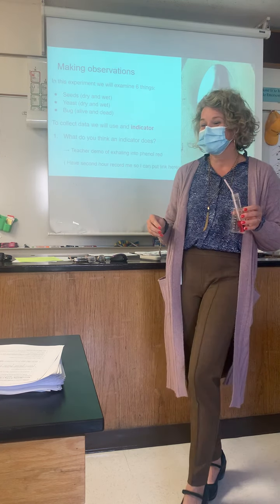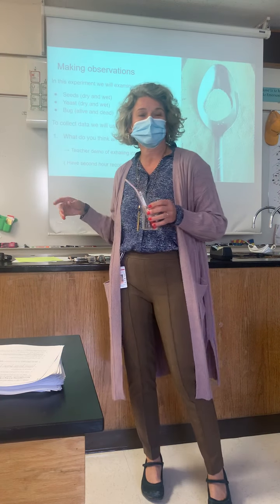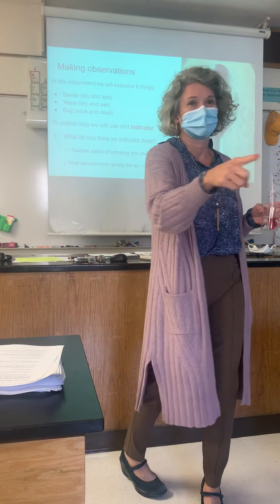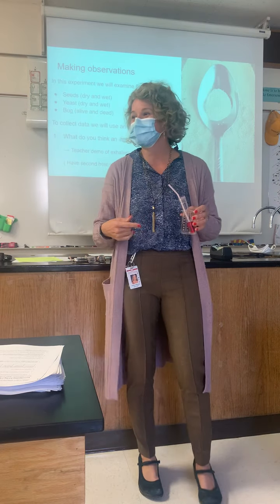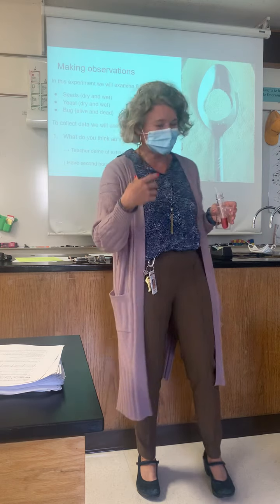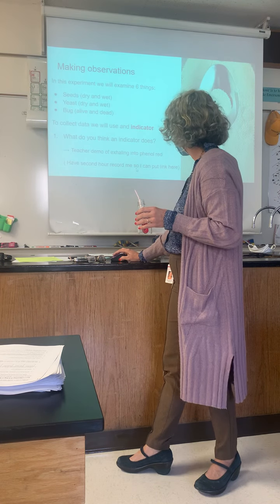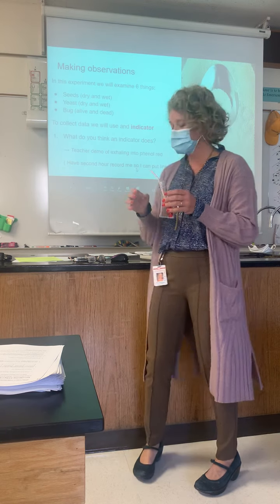All right, come back to me. What do you think an indicator does? Yell out what they said to you. It indicates something, right? That's what I always hear, right? And you're right, an indicator does indicate something. Let me give you a little more information, okay? I'm going to do a demo.